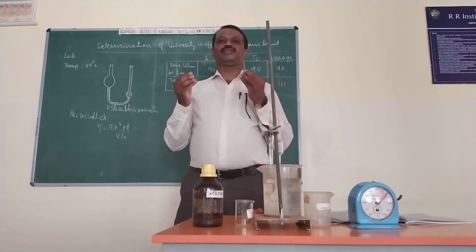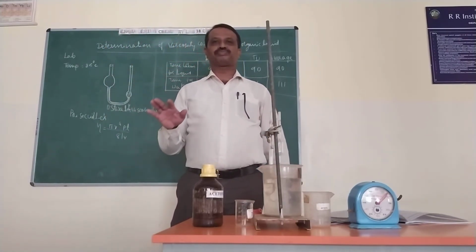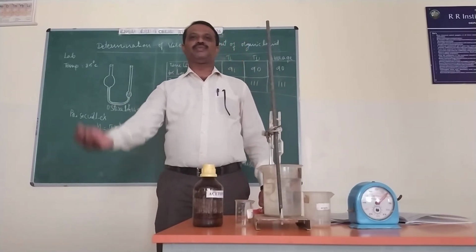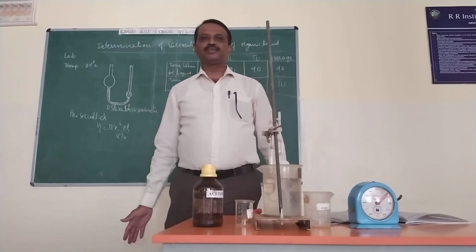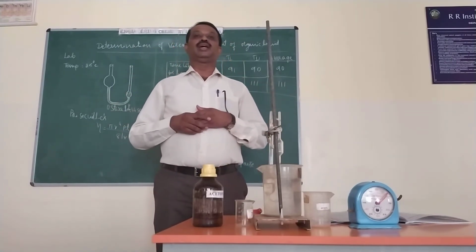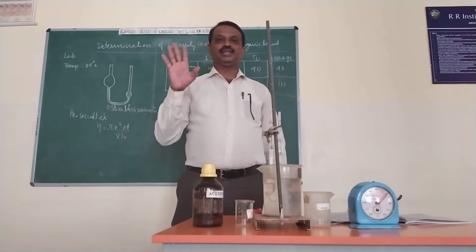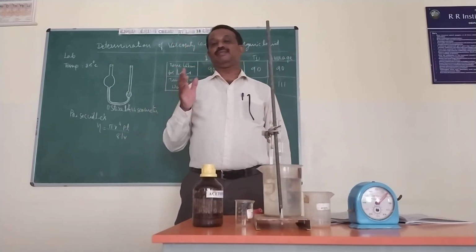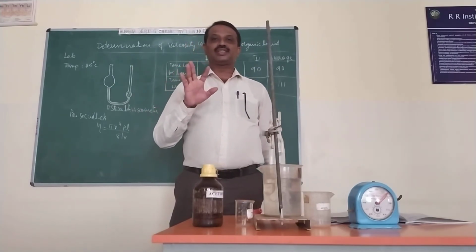So if we pour 100 ml of each of these 3 on an even surface, the movement is this: the first one, which is more evaporating and thinner, moves fast. The second one is water, and the third is castor oil, because castor oil viscosity is the most, water viscosity is average, and petrol viscosity is very low. So viscosity and movement are inversely proportional.